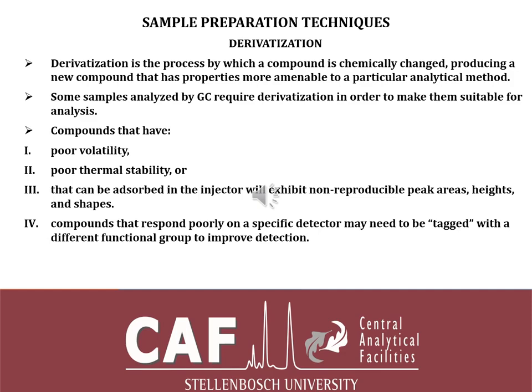Now, a little bit more about derivatization. Remember, I mentioned on-fiber derivatization when I was talking about the SPME, and also the SPE. Just a little bit more about derivatization. Derivatization is the process by which a compound is chemically changed, producing a new compound that has properties more amenable to a particular analytical method.